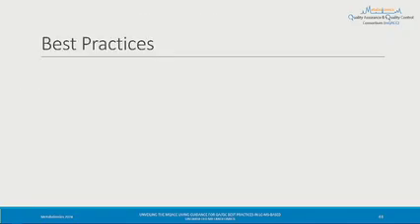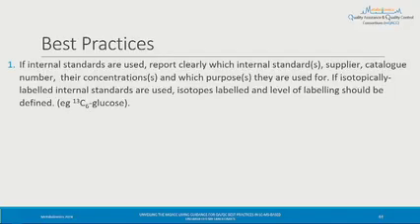So then, if you look at our best practices for internal standards, what we are proposing here is if internal standards are used, we are not mandating that they have to be used, we are saying if you are using internal standards, it needs to be reported clearly which internal standard, supplier, catalog number, what's the concentration, and what's the purpose that you are using the internal standard for.